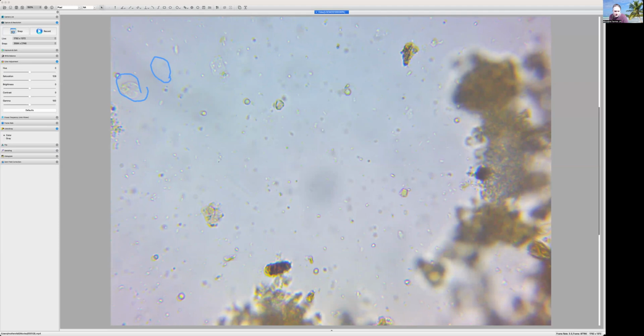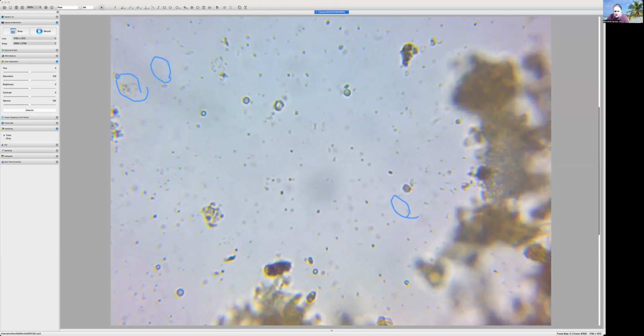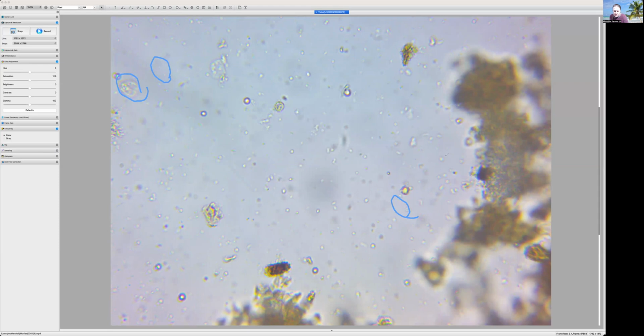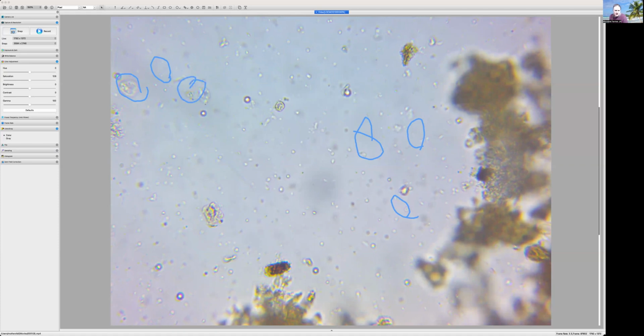If we hold real still and just kind of look and zoom in and out, all these bumbling motions. We've got a flagellate here. I'm just trying to look around. Now this guy's moving fast with what he's doing, but he looks to me to be a flagellate. Okay. We got a flagellate here. We got a flagellate here. Something's really going on here. I think this is a flagellate here attacking.